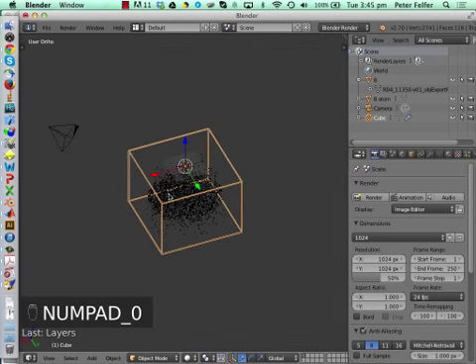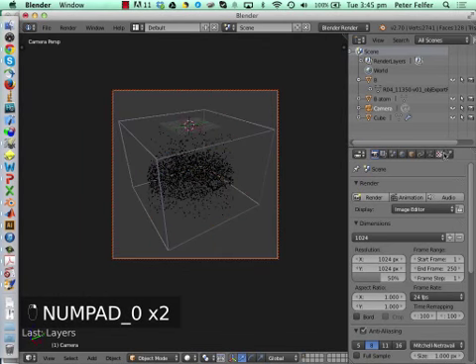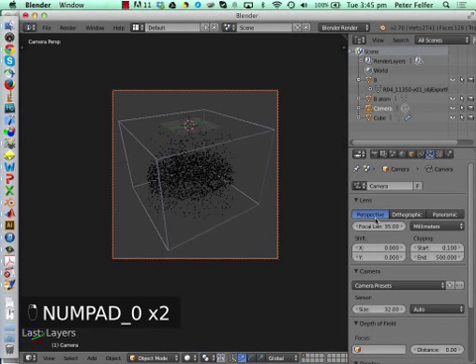One last thing I'm going to cover is camera settings. Right now the camera that we have is a perspective camera with a focal length of 35 millimeters, which gives you the cool 3D effect. I think that's a good thing for a presentation, but a bad thing for a publication. Because in a publication, you don't want to distract from your data through any fancy visual effects. In a presentation, you can get away with it a bit more. In a publication, you shouldn't do that.